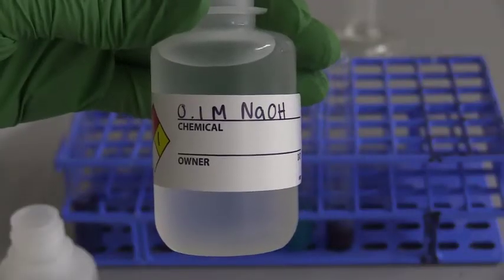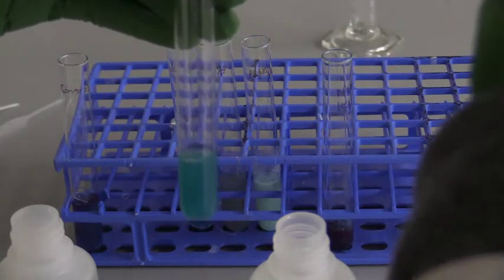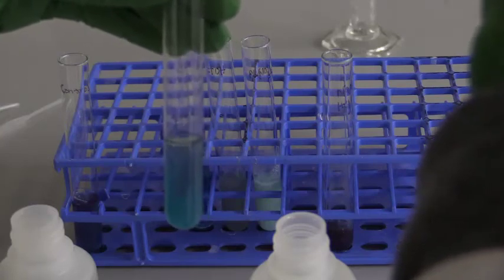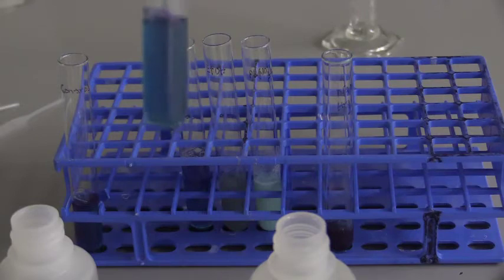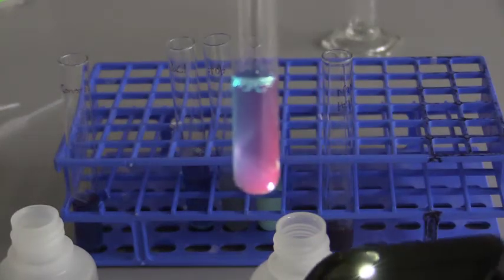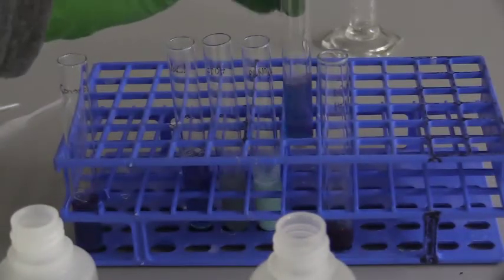And now we're going to add 1 ml of sodium hydroxide to the same sample that we just added hydrochloric acid to. And if there's anything that you notice as the liquid is being dropped in, you can make those observations. And when the light is shined on it, what observations do you see? What kind of tertiary interactions are being disrupted when pH changes?